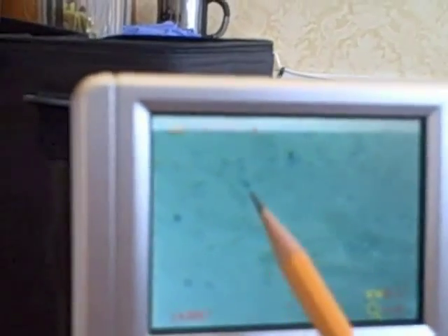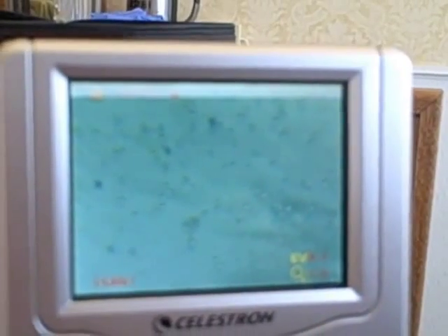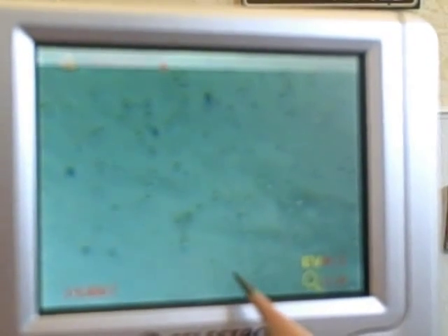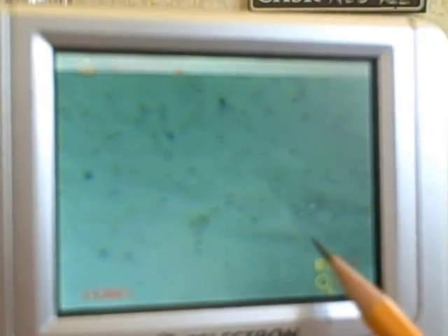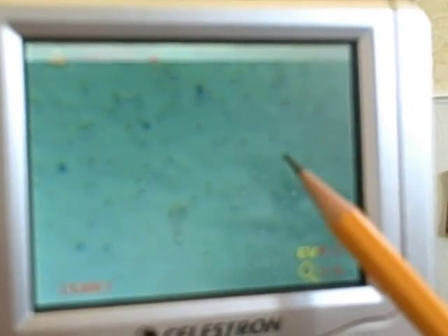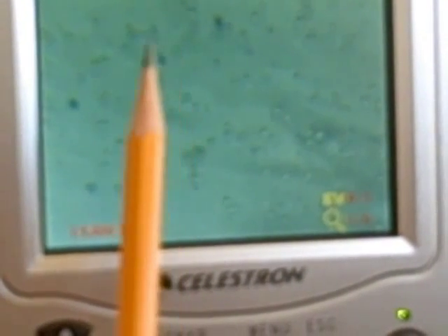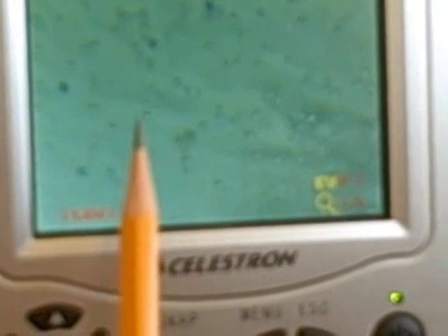You can see all the different yeast. The ones I'm not going to count are because that yeast is touching that line, and that one's touching that line. Now on this side, you can see there's some that are touching, and I'm going to count those. So what I'm going to do now is just go through it with my clicker and count these.